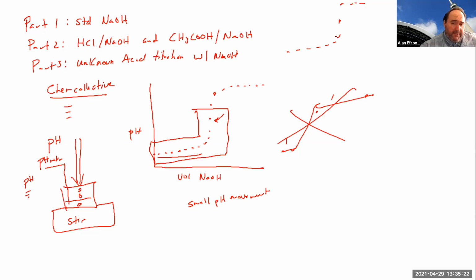So there is going to be a point along the way as you're doing it that you'll start to see, well, I'm adding the same amount of volume, but I'm starting to get a much bigger change in pH. If you notice that, in person or on this software, what you really want to do is try to slow down. And maybe cut down the volume you're adding even more so that you can move really slowly. It's just going to happen as you approach that equivalence point.